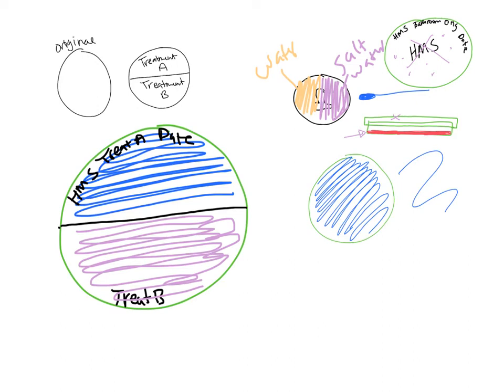And so you're just going to, in the end, want to be able to make comparisons between what it started as, and what the bacteria looked like. Then after you treated it one way, how did that change it? After you did another way, a different way, how did that change it? So you'll compare those two sides to each other and both sides to the original.